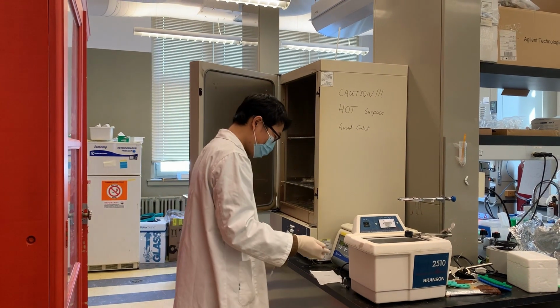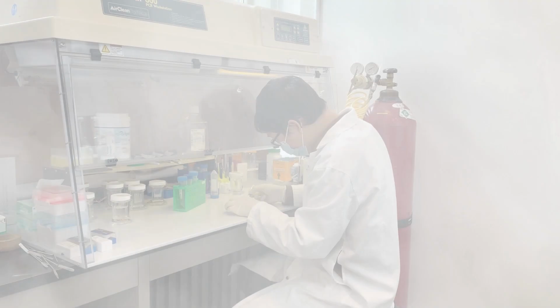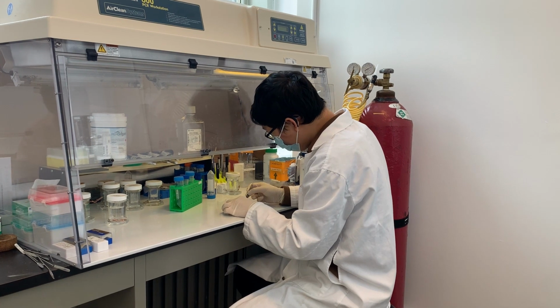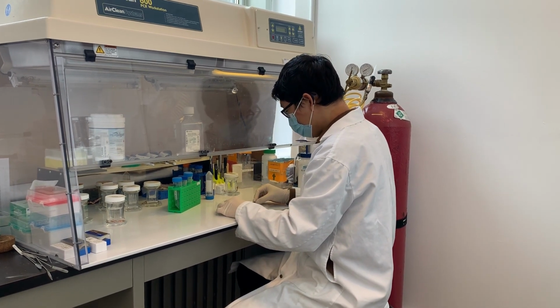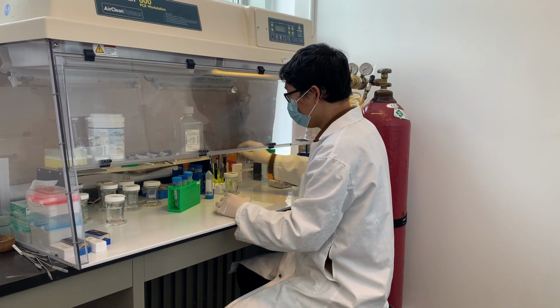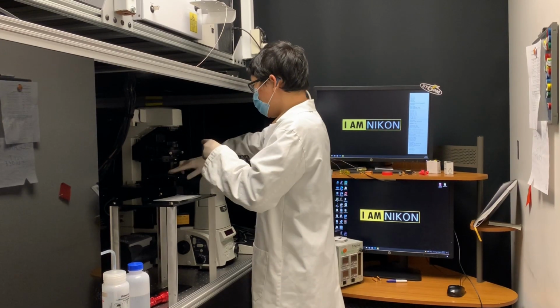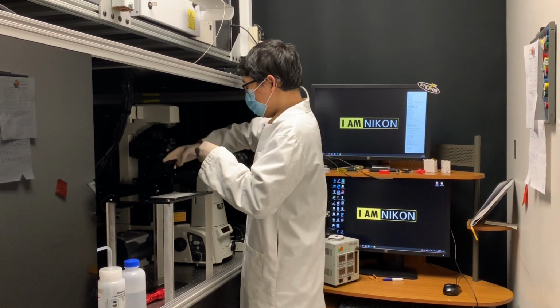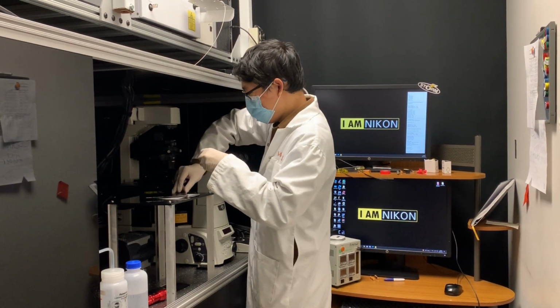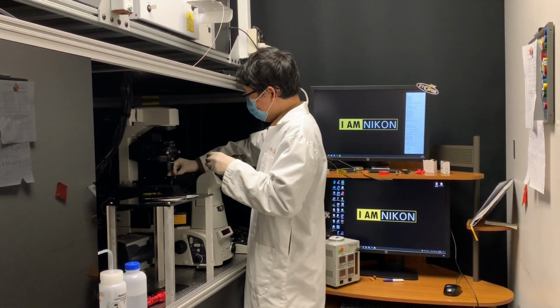Okay, now our coverslip is covered by a PEG layer and ready for the next step. Now we put two silicone ports on top of the silicone spacer, and so our chamber is now completed. Then we inject the buffer with our fluorophore in the chamber and image them in the single molecule microscope. We image the fluorophores alone without any triplet state quenchers. Then we image the fluorophore together with the triplet state quenchers and see how the performance improves.